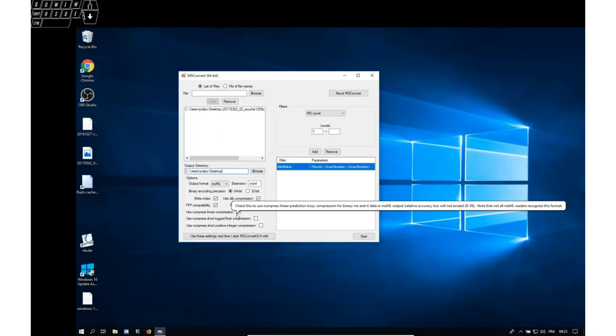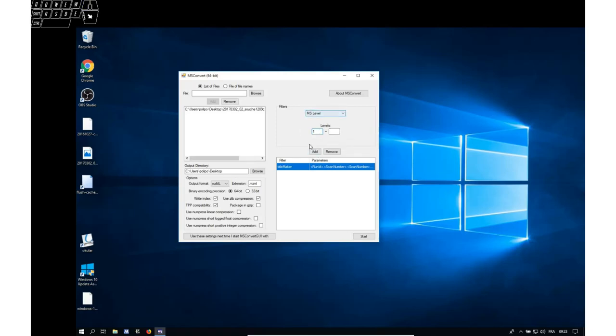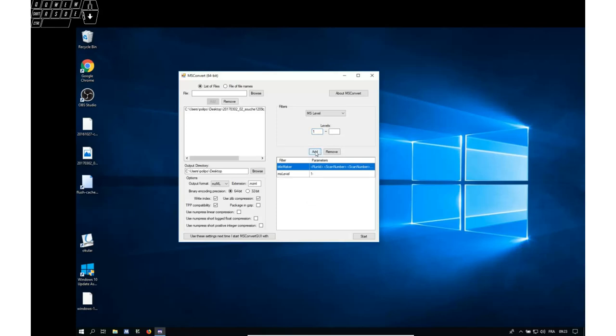And one very important setting is that you ask for the mz level 1 spectra to be extracted. So once you have configured this filter, you need to add it to the actual filters that will be applied. And now we have it.